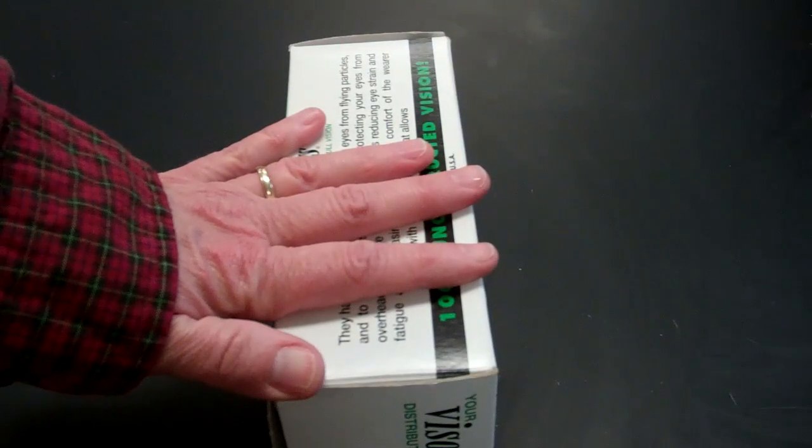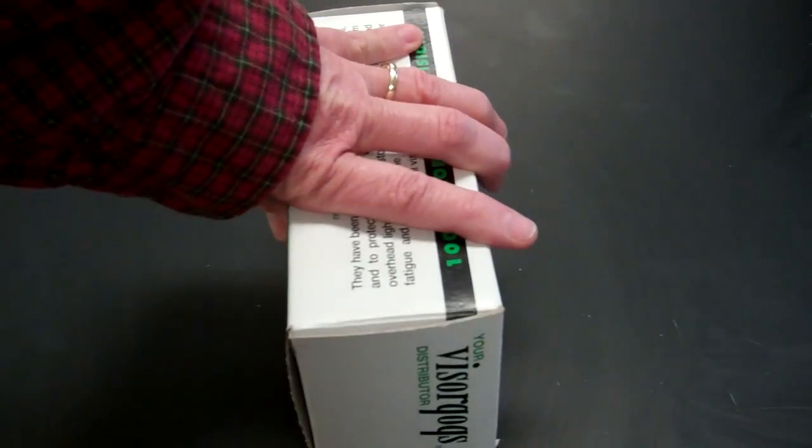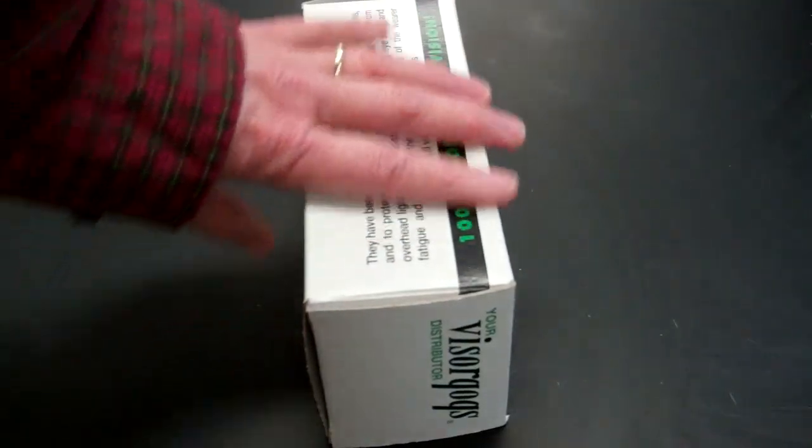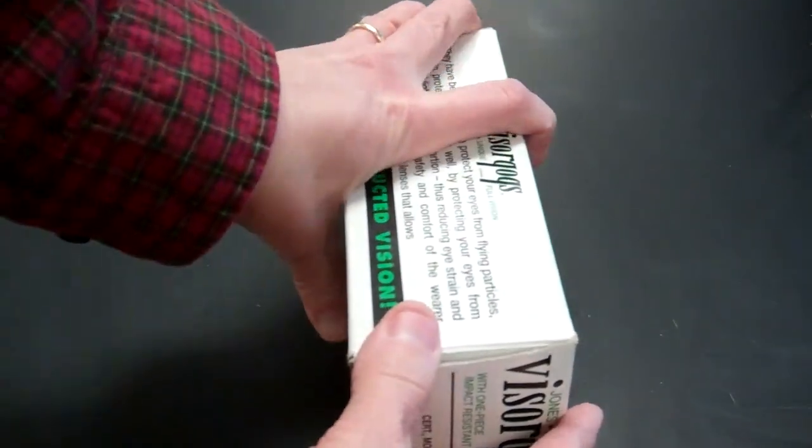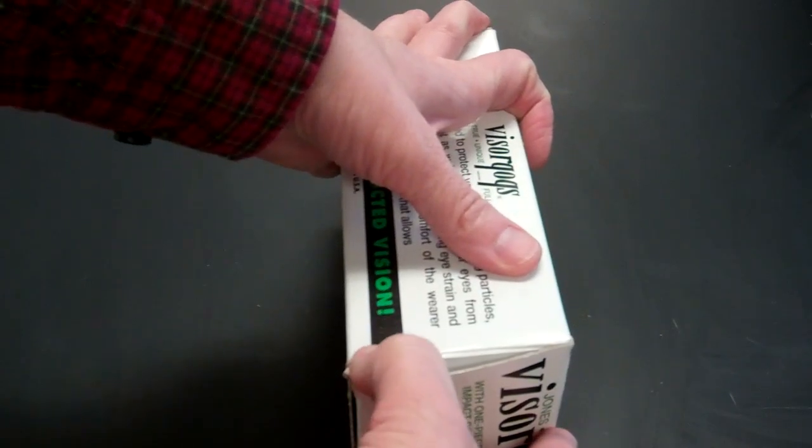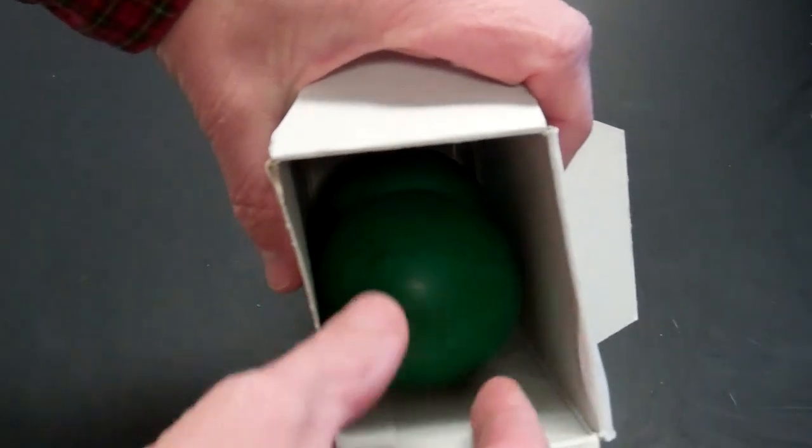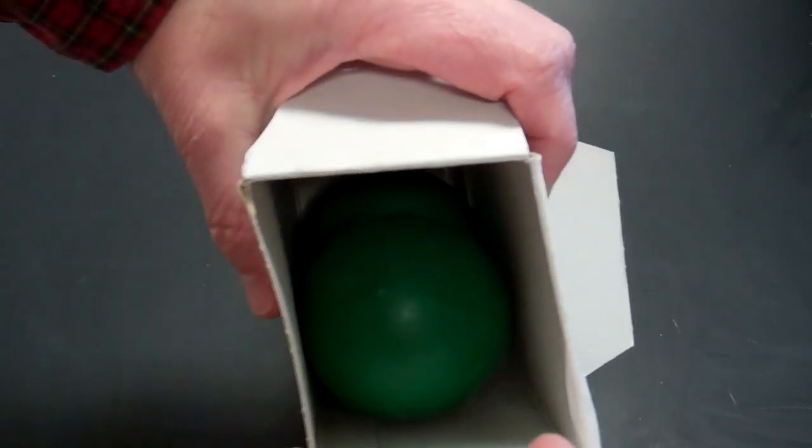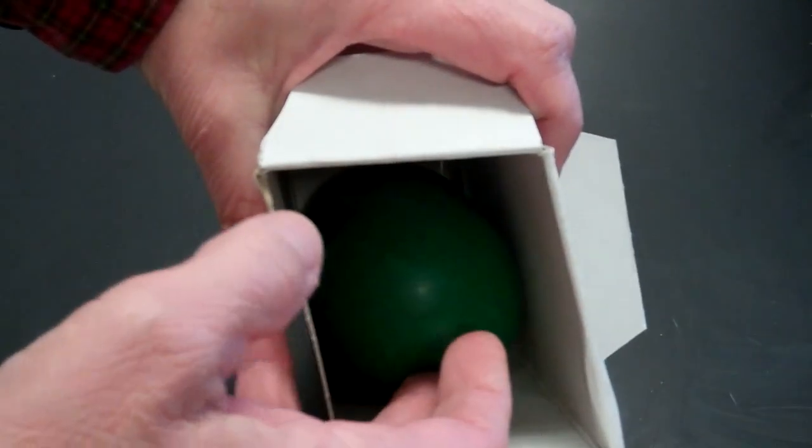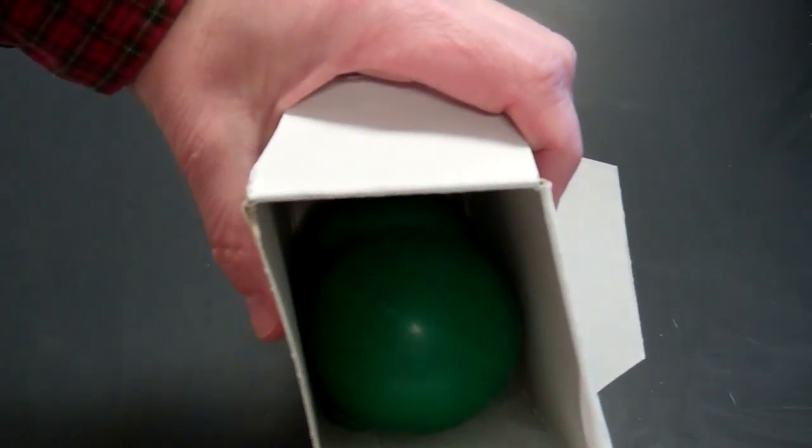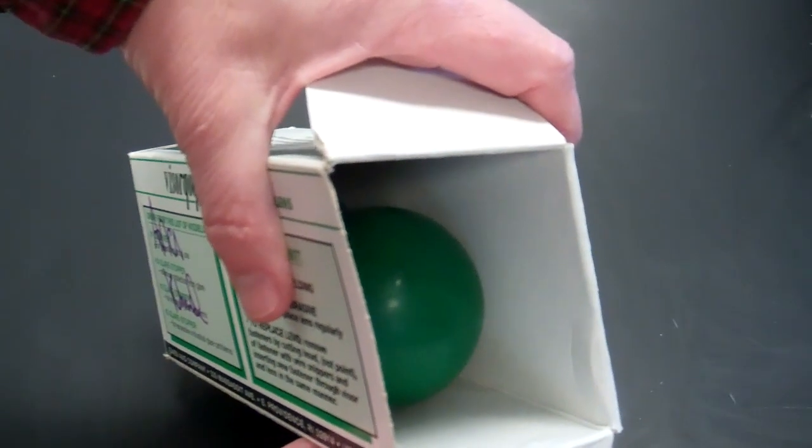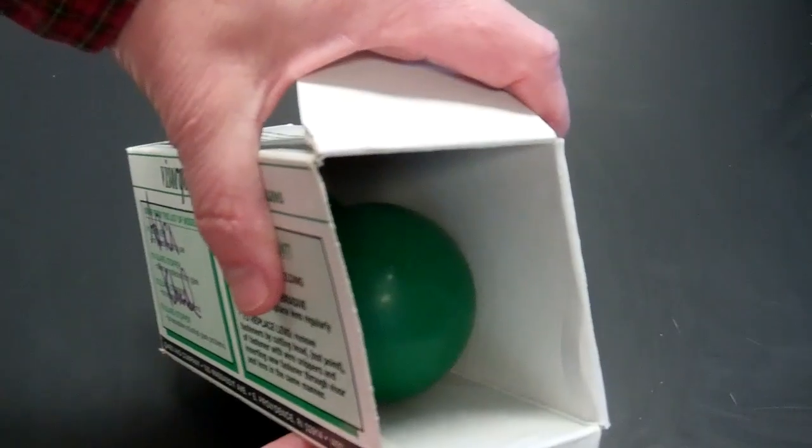And if I were to put this cell in salt water, the cell itself wouldn't change shape. It's going to remain this box-like shape. So, it's going to stay 3D because of the toughness of the cell wall. But, if we look inside, now assuming that we put this cell in salt water, the cell membrane will have shrunken in a little bit. So, it's not quite up against the edge. It's smaller. It lost some water and everything that's inside of it would be balled up on the inside. So, it has shrunken away from the edges of our cell.